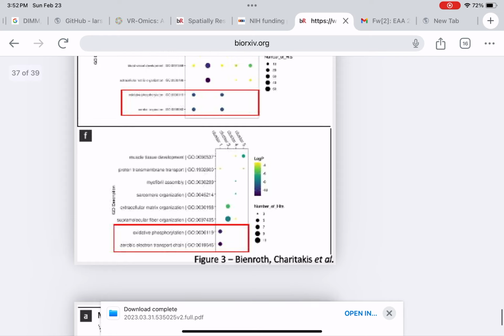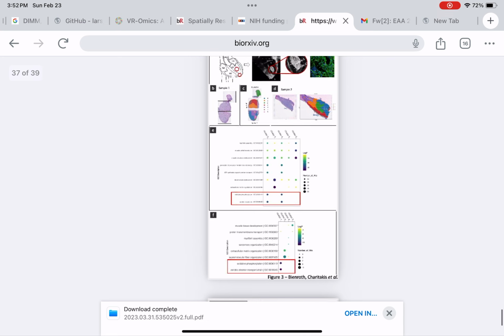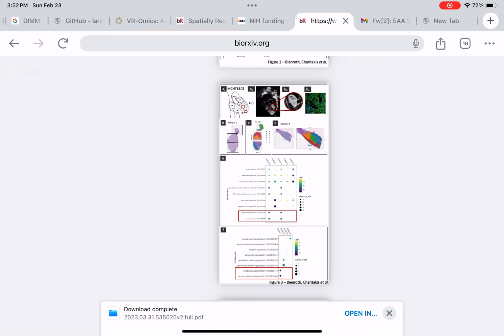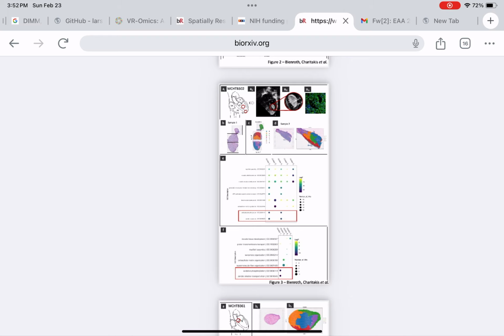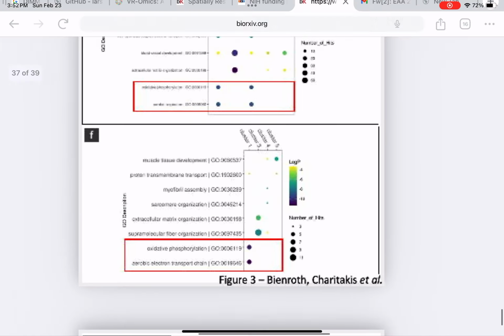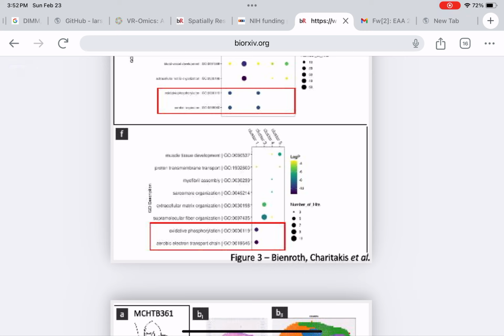These two avenues for validation demonstrate that the molecular signatures we identified are robust in both intra- and inter-patient samples. The ability to generate a single data object across multiple planar Visium sections allowed for a better understanding of the distribution of cell populations across the tumor, which would have otherwise been lost due to artificial tissue separation across capture areas. VR-Omics GUI makes this process easy and intuitive by simplifying data joining to a simple drag-and-drop alignment exercise of Visium slices within the VR-Omics GUI, eliminating the need for computational steps to generate a single data object. Supplementary Video 1.